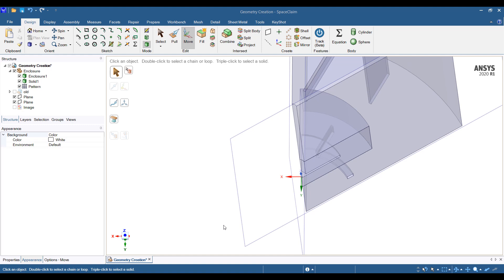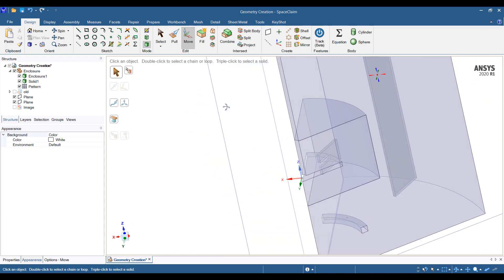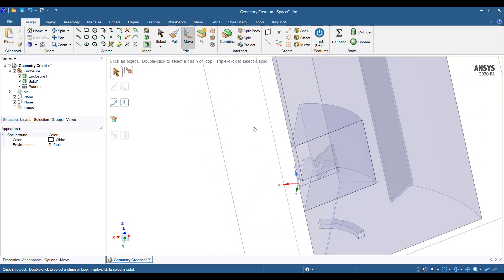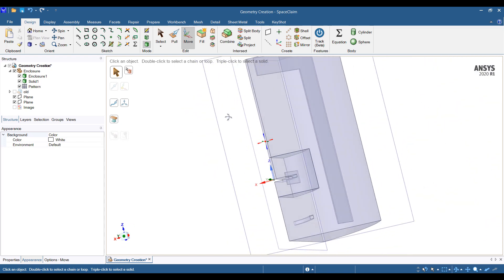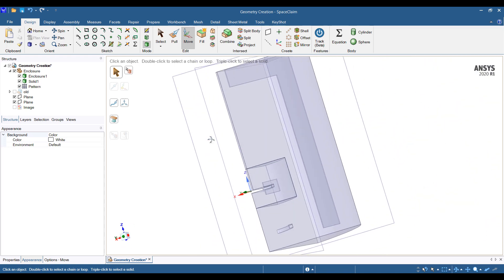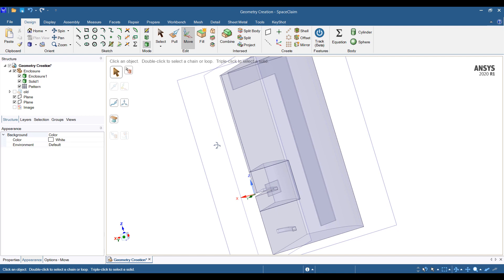Hi, this is Mingyao from Singularity Engineering, and in this video I'll go through quickly the setup of a simple flow simulation. With mixing tanks like this, it's always better to start with a simulation of just the flow so we have good initial conditions.